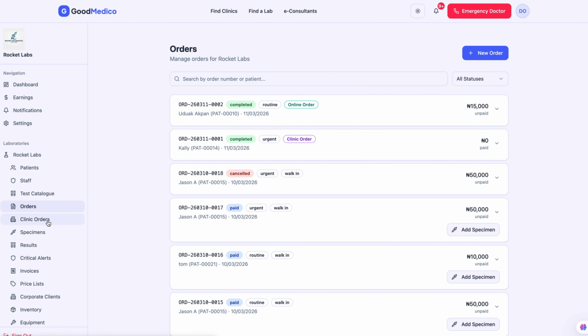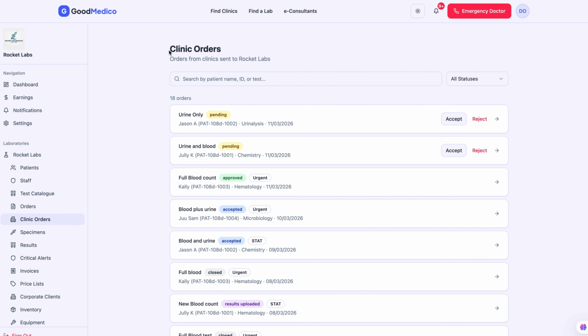Usually orders that come from the clinic will show up under Clinic Orders in the lab menu. Click on Clinic Orders. This will open an order list. As you can see, we have 2 new clinic orders that came in. Let's process the first one.